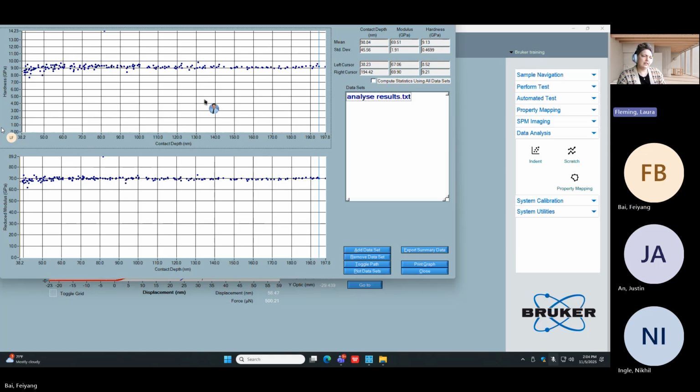I think people forget these instruments are highly scientific and it feels kind of unreal sometimes. And I think people forget that it is a very physical act that we are doing. Nano indentation is a very physical thing, right? So what's happening physically is just as important as what you're seeing. Anyone can do an indent. Whether or not the indent is good is a totally different question. So these are the questions we have to consider. I have a colleague who likes to say nano indentation is not easy, and it is a trivial statement and also true, which is very annoying.